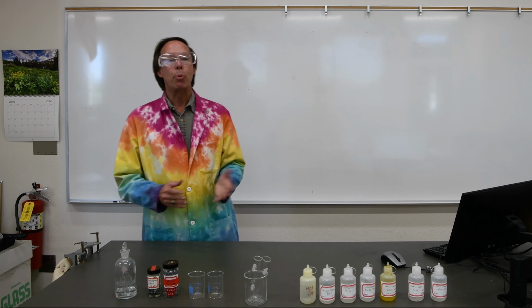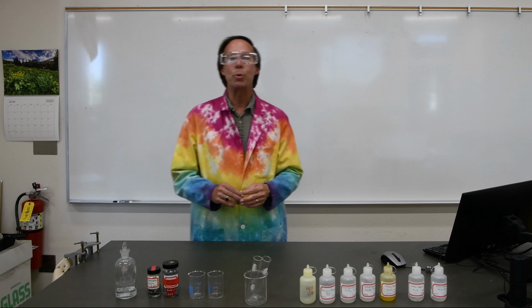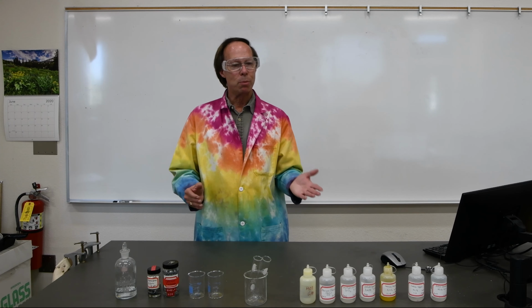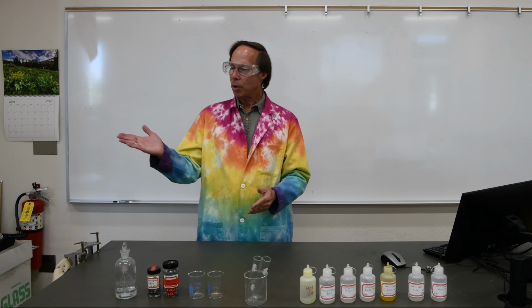I have written a pre-lab which will go into much more detail. This is just an introduction, so be sure to read the pre-lab, which will talk in more detail about how to analyze the data that you collect, and then we'll head on over into the lab and carry out these reactions.